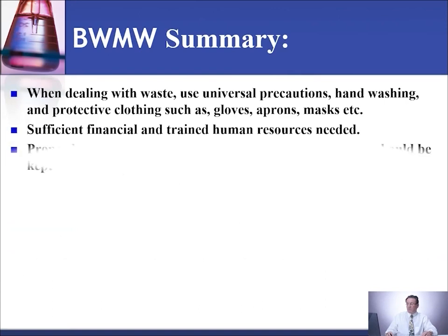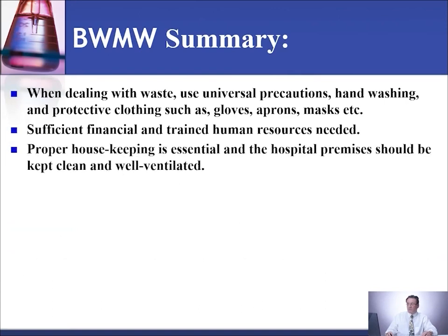When dealing with waste, use universal precautions, hand washing, and PPE like protective clothing such as gloves, apron, masks. Sufficient financial and trained human resources are needed when dealing with biomedical waste management. Proper housekeeping is essential, and the hospital premises should be kept clean and well ventilated.